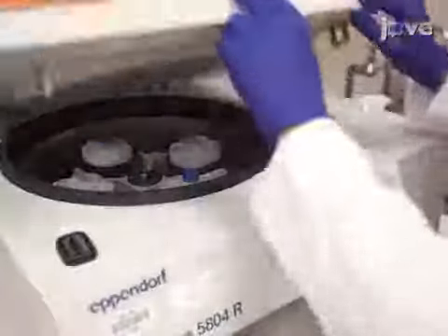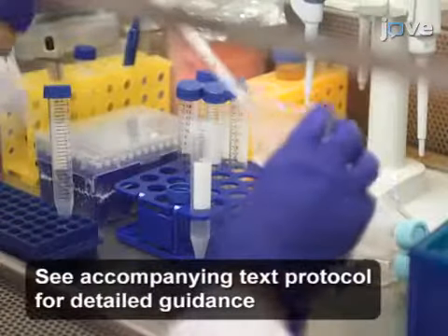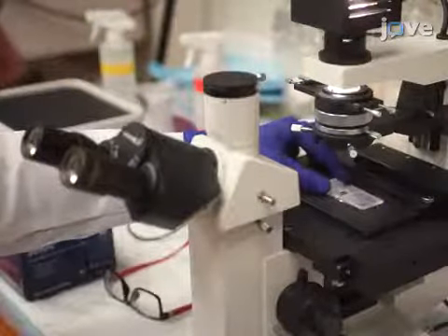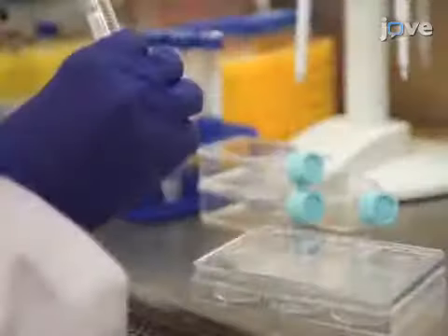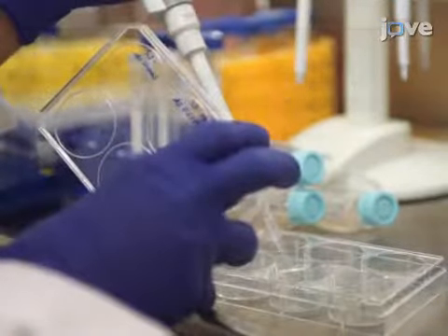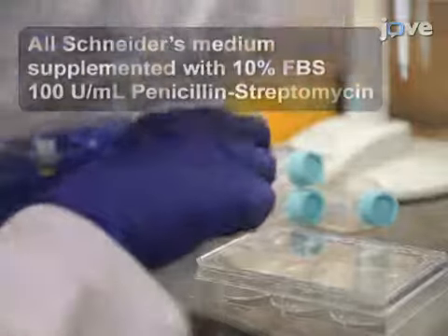Begin the assessment by spinning down signal receiving cells and resuspending them in Schneider's medium. Count the cells manually using a hemocytometer. Plate 5 × 10⁵ S2 and stable S2 Notch cells in each well of a 6-well plate in 1 ml per well of Schneider's medium.